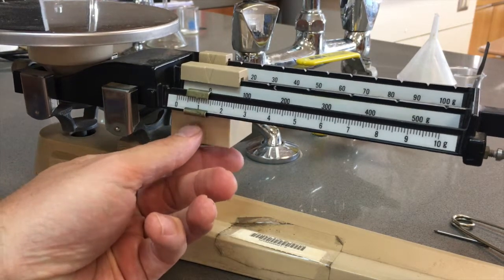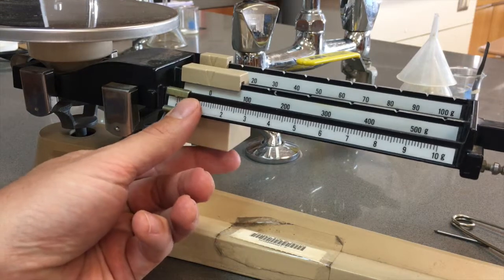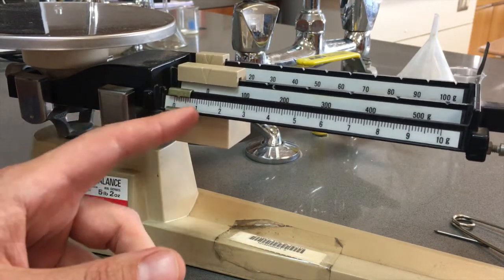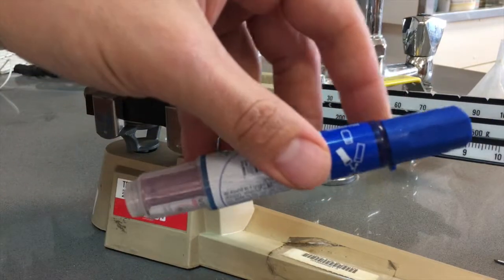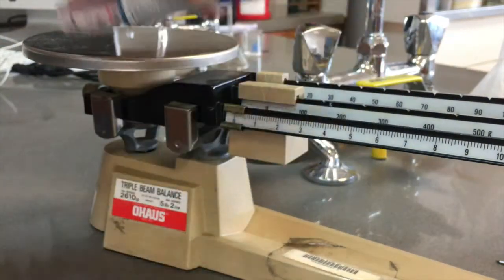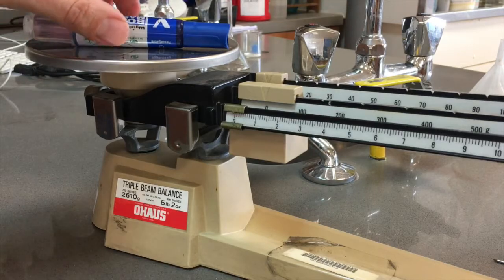And the masses on this, they're called sliders. They can slide across, and then we put something on what's called the pan. The pan is right here, so I'll put this marker on the pan.